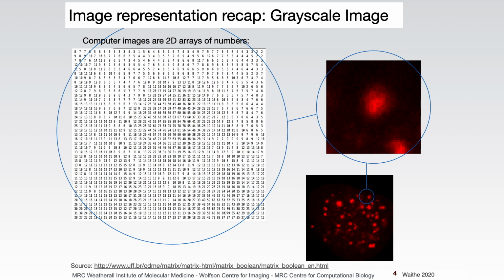So, before we go into that, I just want to recap some of the things that you probably saw during the practical and this morning. So, just a recap: your image is now comprised of data or of values. Hopefully, you all now believe me. You all saw this firsthand. You had your cursor over the image, and you were able to see the values. And this is how you would imagine a grayscale image to be composed. If you sort of squint your eyes a little bit, you can actually see the image here almost.